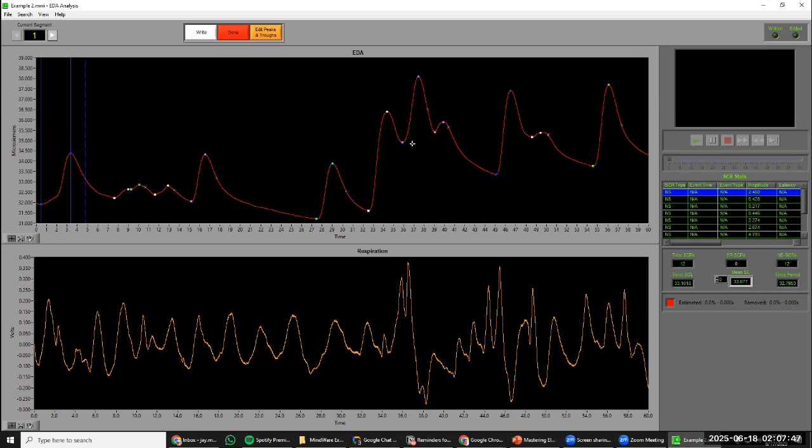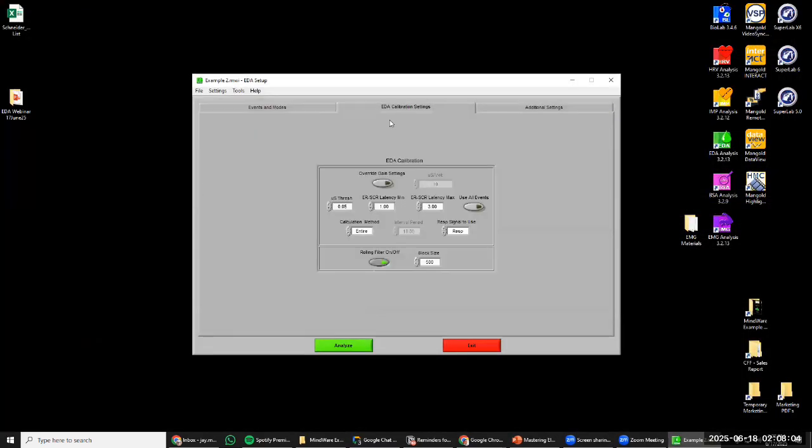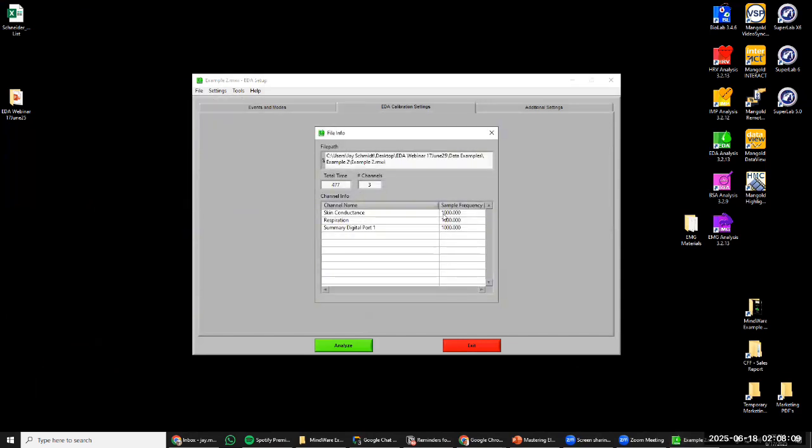Normally, with these kinds of things, we don't see the skin conductance level drop back down and then have a small rise afterwards. This sort of structure is usually indicative of messy data. So in these cases, this is a recommendation I would certainly reach out to MindWare about, but we can see we're actually sampling at 1,000 hertz here.